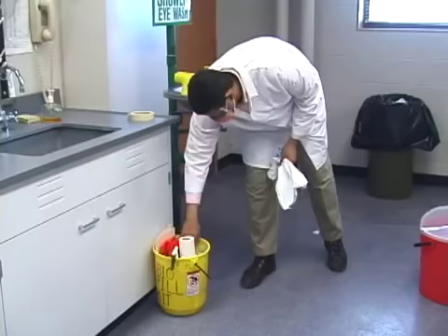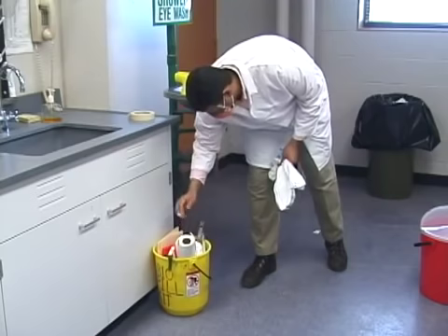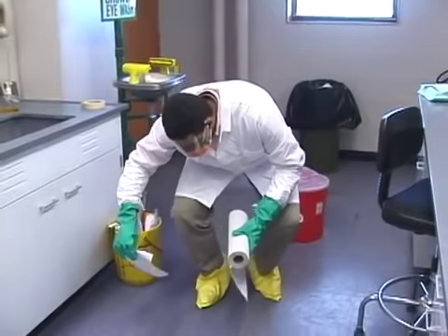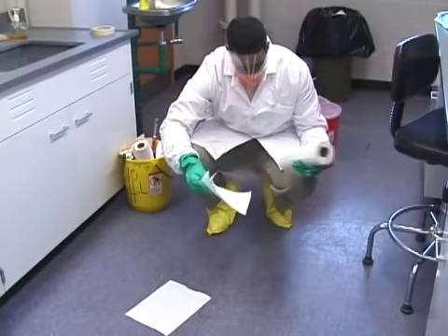Prepare to clean up the spill by assembling your spill cleanup materials and donning your personal protective equipment. For large spills, you will want eye, nose, and mouth protection, a lab coat, two pairs of gloves, and disposable shoe covers.